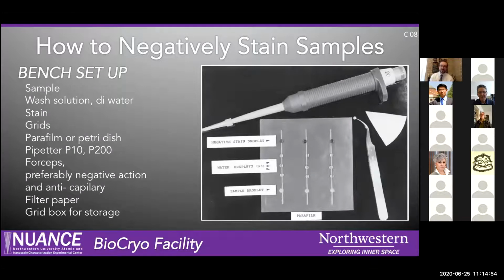So how do you negative stain? There are, as we're saying, many recipes, many methods. As I said earlier too, it's a fairly simple setup. But what I like to point out is that when you have your setup for staining, you want to have it set up in advance and in pretty close proximity, because things will move very quickly and it will be to your benefit to do that.